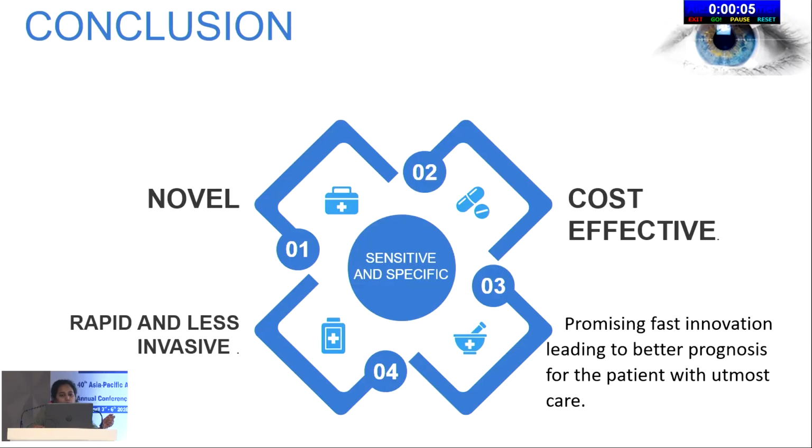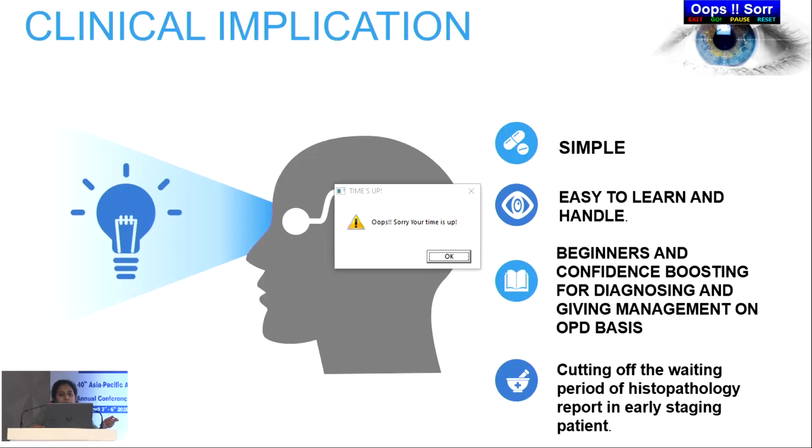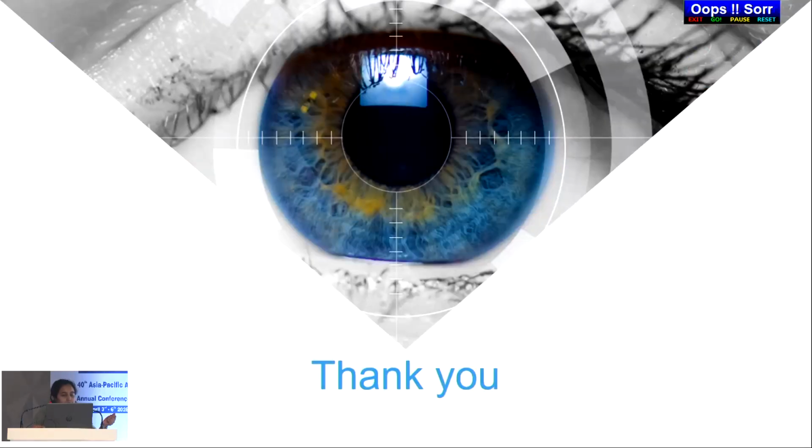Coming to the conclusion, it is a novel technique that is rapid, less invasive and cost effective, and it can promote fast innovation for better prognosis. It is very simple, easy to learn and handle, and beginners can also diagnose, and management can be done with supervision. It can help cut the waiting period for the histopathology report in the early stage. Thank you.